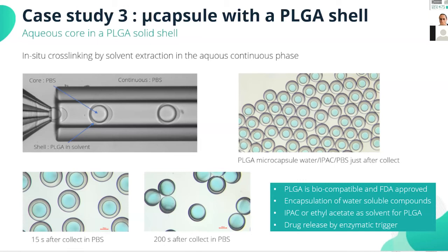Using this setup, you can, for example, encapsulate water-soluble API or biomaterial, and then you can release this material in the gastric system when the PLGA is dissolved. PLGA is widely used in the pharma world because it is biocompatible and FDA approved.